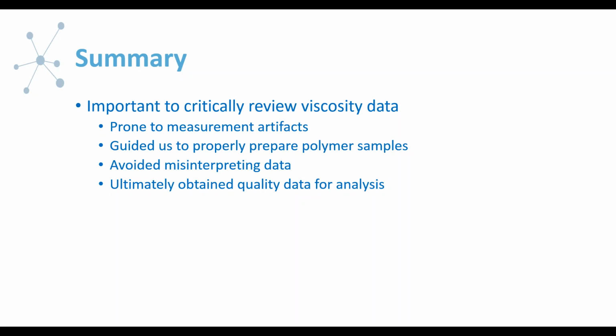It's very important to look at your data and critically review what's happening, because this type of measurement is prone to artifacts, since it is a calculated property. In this case, looking closely at the data and thinking about our system and what was happening guided us to question how we were preparing our polymer samples, and then to properly prepare them in the end.